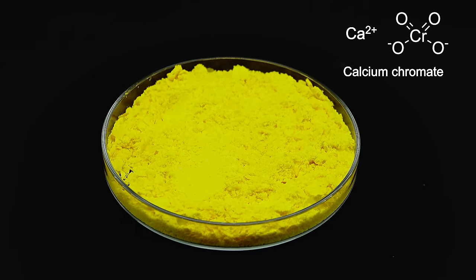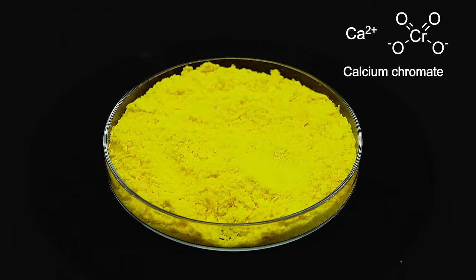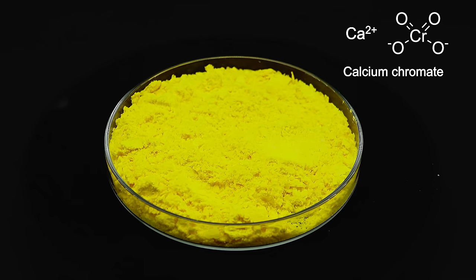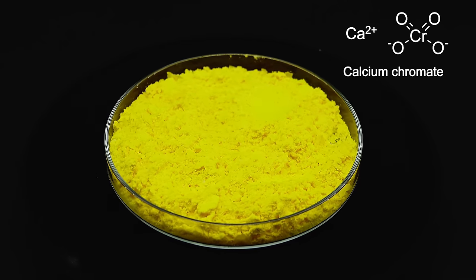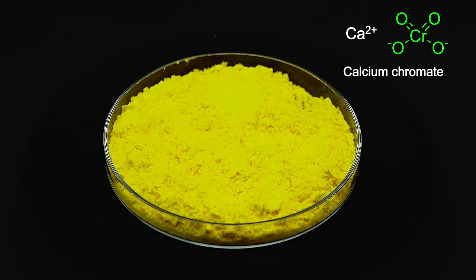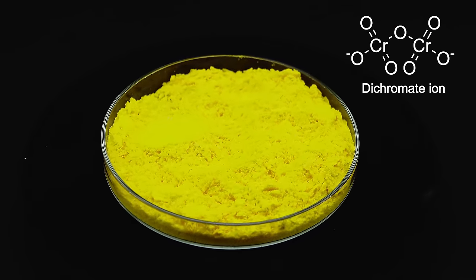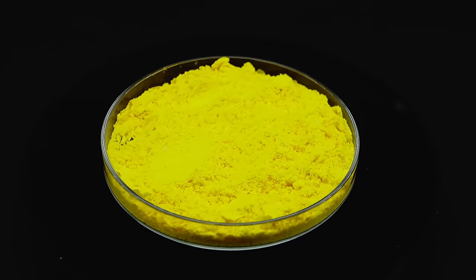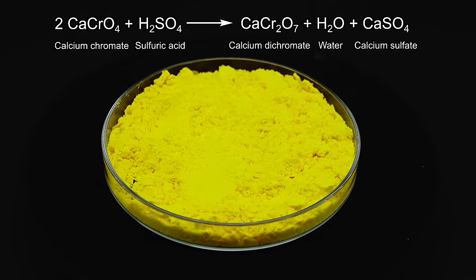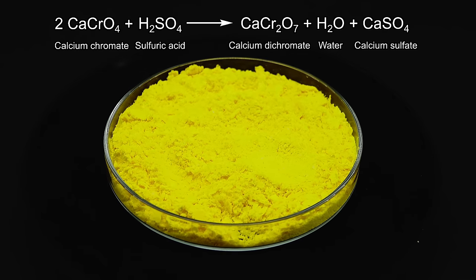To turn my calcium chromate into potassium dichromate, I have to carry out two chemical reactions, which I like to see as the fine-tuning of the chromium 6 skeleton I built using all the previous processes. I first have to take care of the chromate part, since the ion I need is dichromate, which while being rather similar is not the same thing. Fortunately, it's quite easy to make it from the chromate — all I need to do is react it with some sulfuric acid, which kicks off one calcium of the calcium chromate, turning it into calcium dichromate and calcium sulfate.